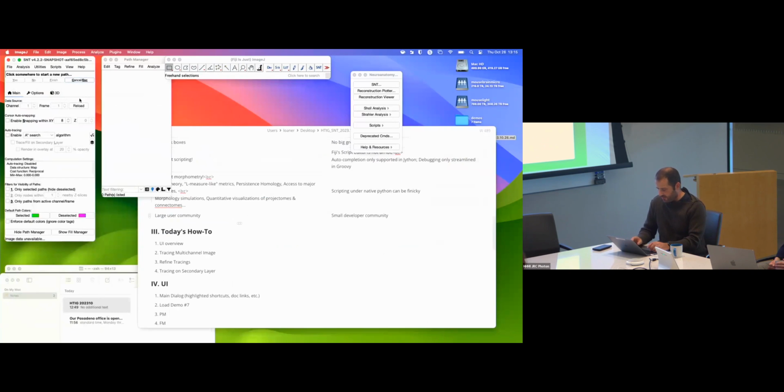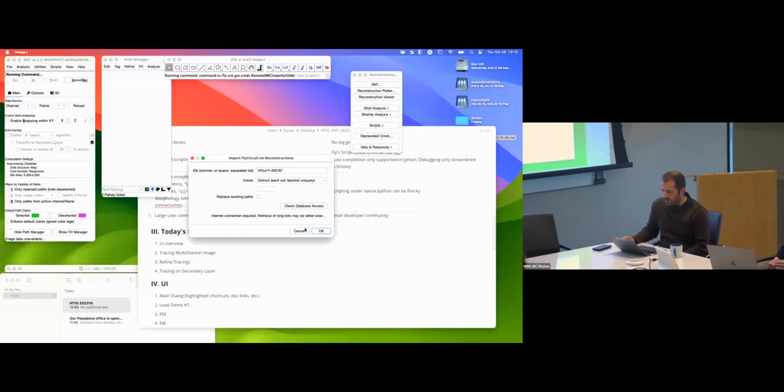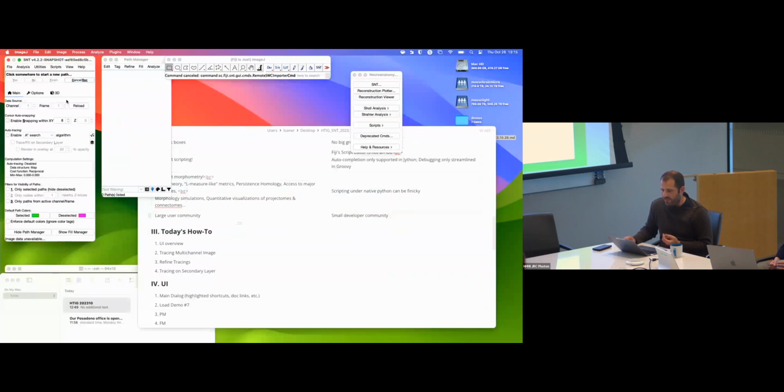The other thing we did, you have utilities here, a command palette, and this is typical of what you find elsewhere. You can type for things and look for them, and it tells you where they are. So if you want to load something, you can look for it, click, and it opens. So that's one thing.